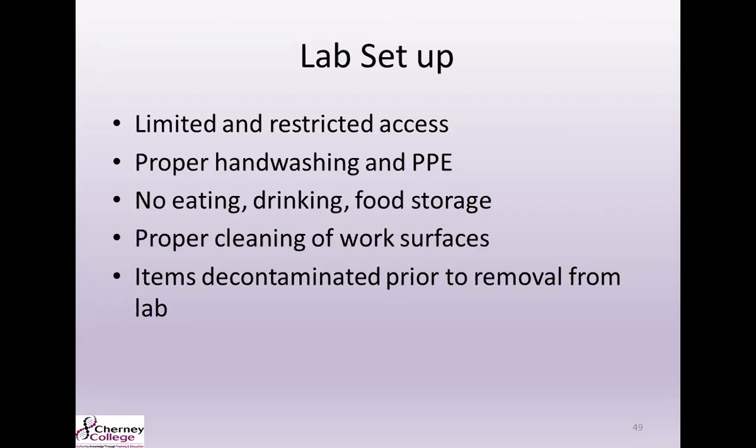Make sure there's no eating, no drinking, no food storage within the lab, and make sure that you have proper cleaning practices, proper SOPs that demonstrate how to clean your work surfaces effectively. Items should be decontaminated prior to removal from the lab. Don't be taking your cell phone in and out like I mentioned earlier. You don't want to introduce any contaminants, and you don't want to take any pathogens home with you.